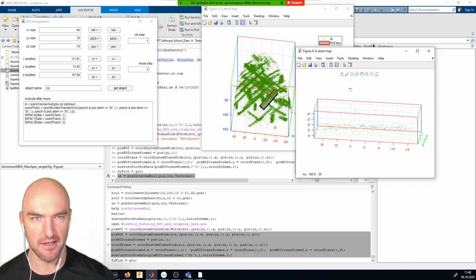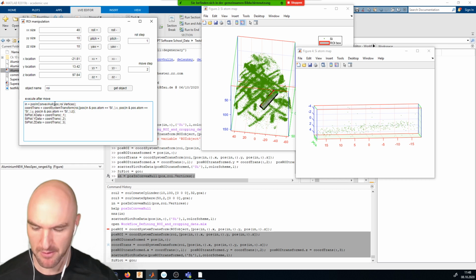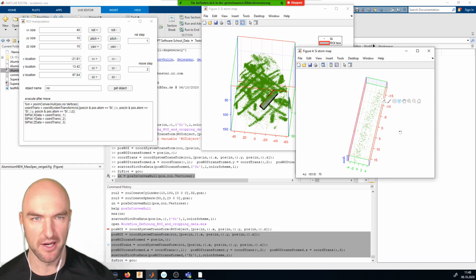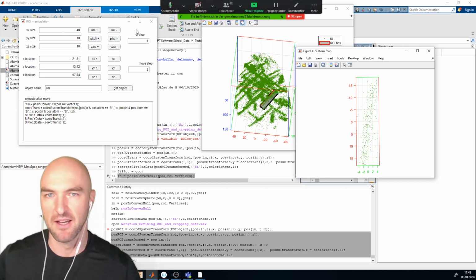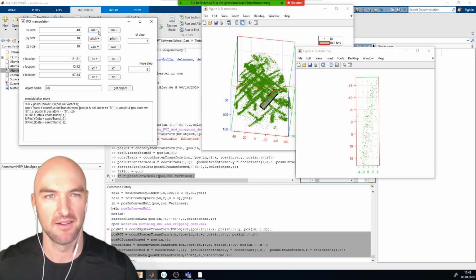And the containment tests are usually what takes the longest. So I think it's a pretty good idea, if you're aligning something, that you just comment out the containment test. Then everything runs a whole lot faster. Yes, you can downsize. If you do coarse alignments like that, Andy is absolutely right, you could just use 1% of the data, then it goes much faster as well. If you do it with only 1% of the data, it will be pretty snappy.